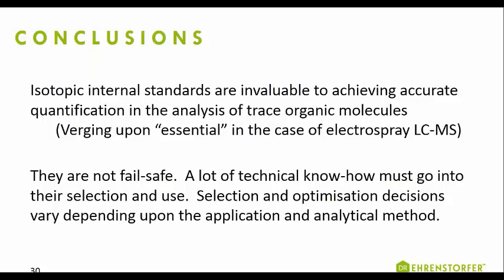So, in conclusion, I would say that isotopic internal standards are a little bit more than just an invaluable aid. In the case of LCMS, they can be essential for accurate results, but they're not a panacea. If you do not apply some real expertise to their synthesis, selection and use, then results still might not turn out as intended. These decisions depend upon the specific application and analytical method. With the right choices, you can get excellent results.